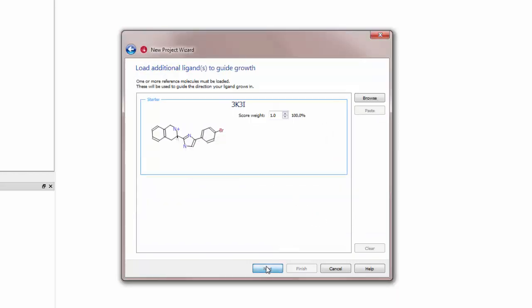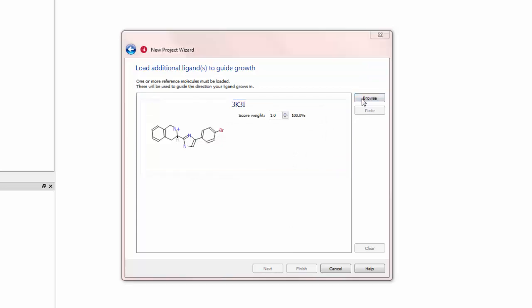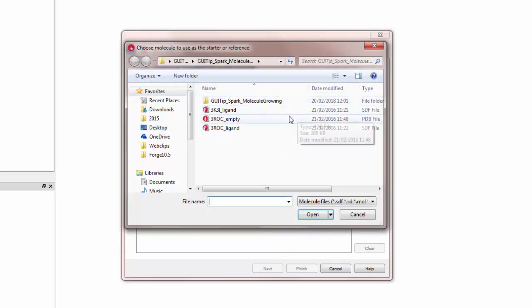The following panel asks me to bring in a structure of the ligand to grow onto. I will browse and choose 3ROC.